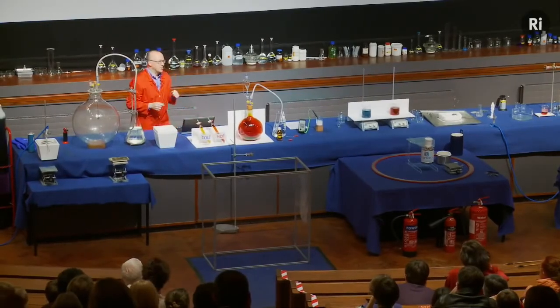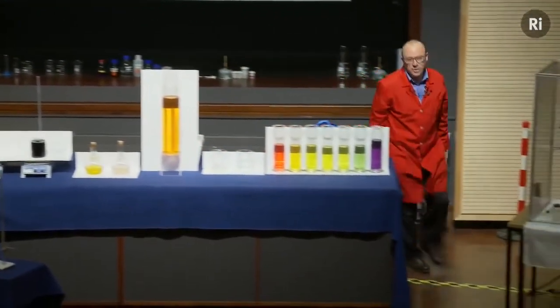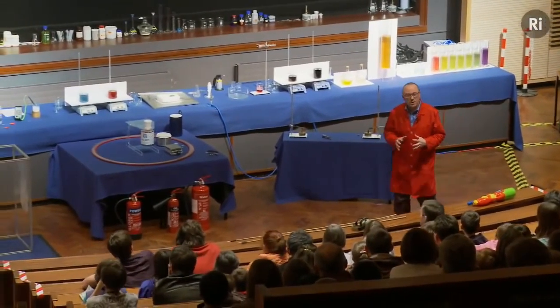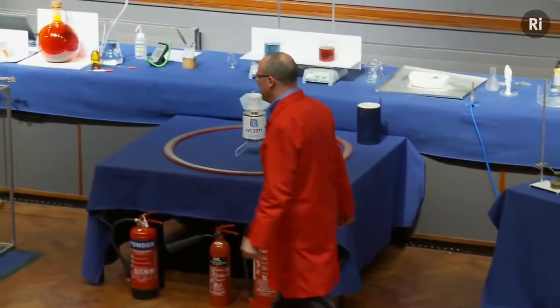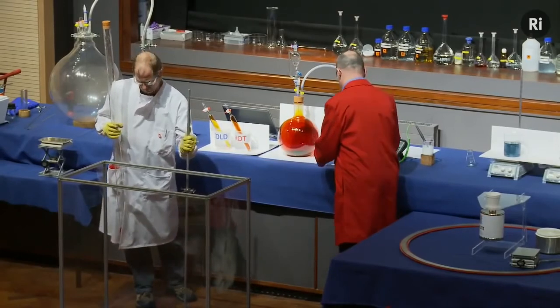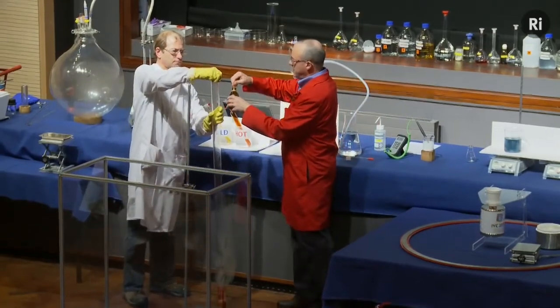All right, well, that really is the end of the lecture, but I thought we'd have just one more demonstration to finish. And I thought what we would do is to repeat one of the earlier demonstrations. It's the demonstration of the reaction between nitric oxide and carbon disulfide, but I thought we'd do it on a slightly bigger scale. Right. So Chris is bringing on a tube of nitric oxide. So I'm going to add the carbon disulfide.